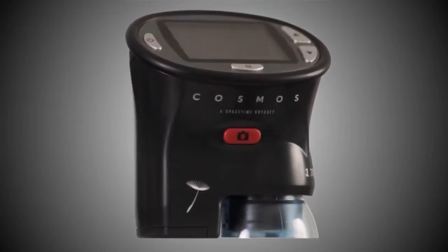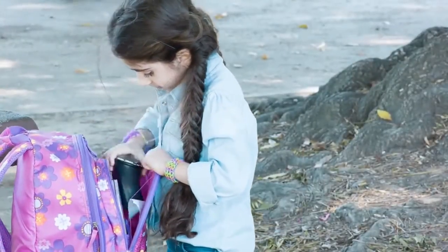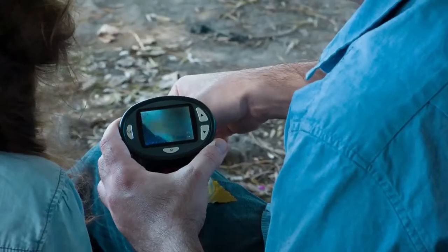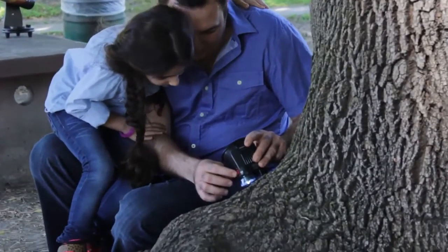The portable Cosmos LCD handheld digital microscope fits easily into a backpack or purse so you can explore anywhere. Observe specimens in real time on the 2.4 inch color LCD screen, with magnification up to 54 times.